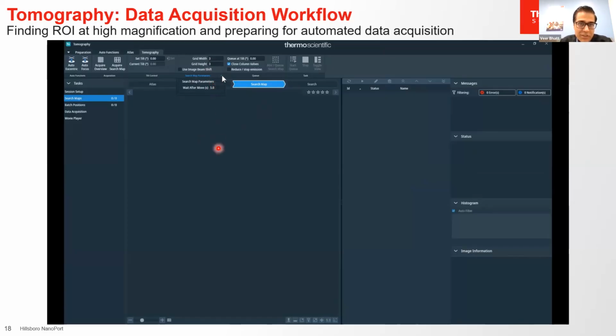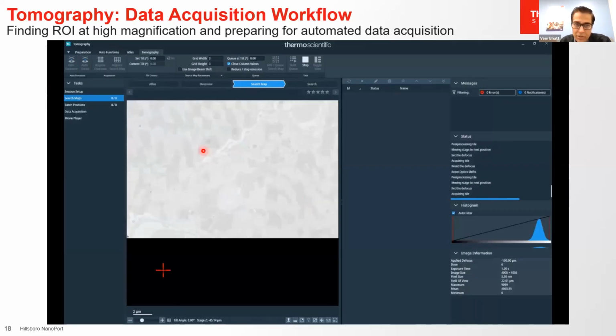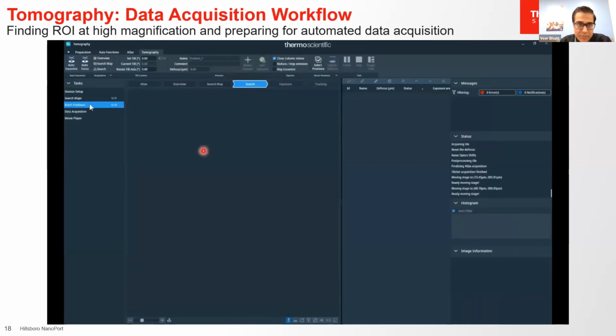Here it's 5 seconds, and that's generally a little more than what we need. And when I start capturing it, this is how it looks, again a sped up video of the capture. The key idea here is to drive us closer and more precisely towards the region of interest. That's all this exercise is really about.